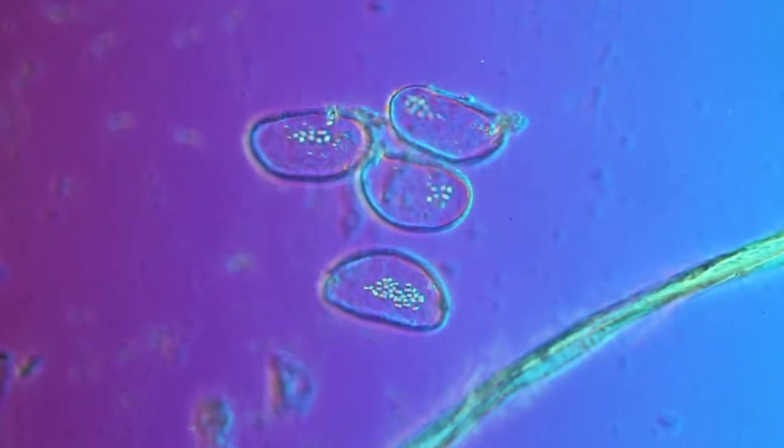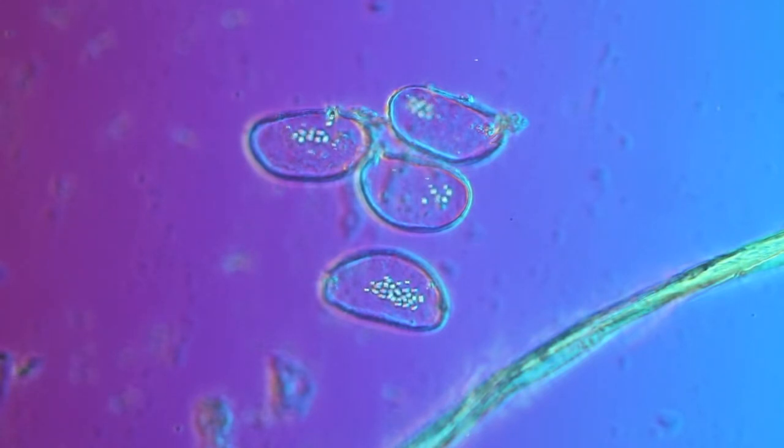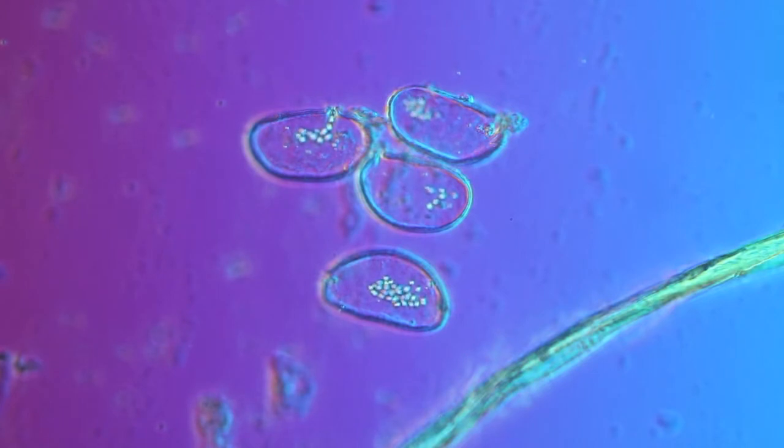So what's really interesting is that once you pop open one of these pollen grains, a lot of these tiny structures inside come out and seem to swim around, and we're not really sure if this is Brownian movement or if these things have flagella on them which allow them to swim around. So what I'm going to do is videotape this for quite some time, and again put it in a high-speed playback, and we'll see if there's anything interesting going on inside these pollen grains with these tiny little structures.